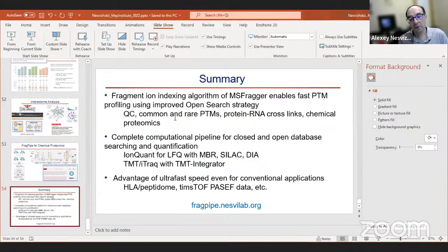Now, out of that half that's still not matched, there is a lot of low quality data because the instruments are fast, so you're often just acquiring MS/MS on nothing, because there was no strong signal to acquire MS/MS on. But there is also a lot of high quality spectra still left. So even with open searching, maybe you explain 60% of all spectra, but probably 70, 80% of high quality spectra. So what are those extra 20%?